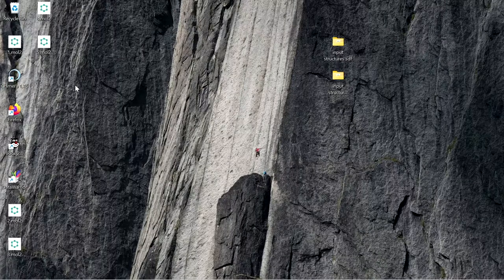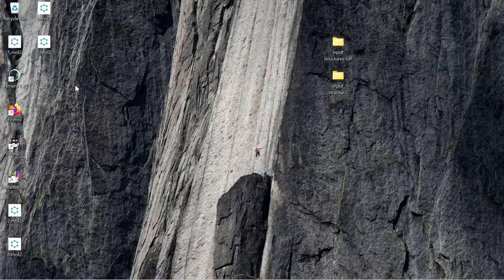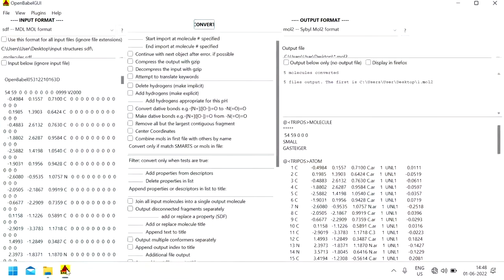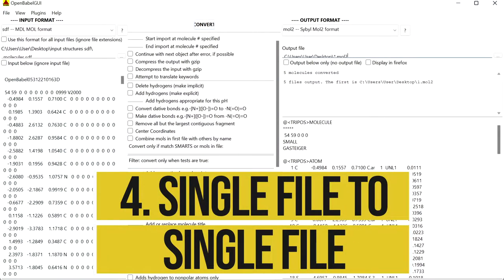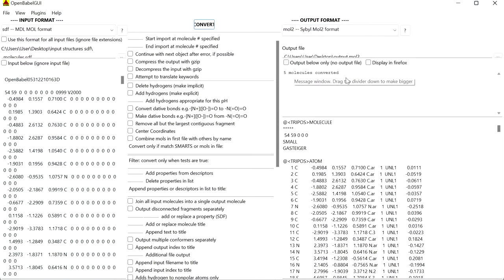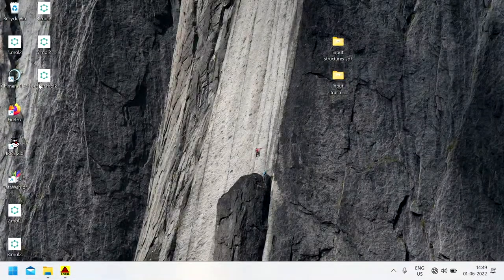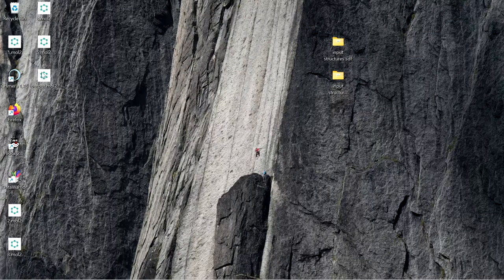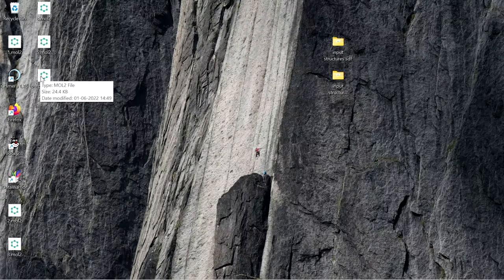You can also convert that single sdf file into a single output file with a different file format, for example mol2, pdb, pdbqt, etc. If you want to convert into a single mol2 file, enter the name of the output file as output.mol2. Now you can see five molecules are converted which are in the same file. In this output.mol2 file you have all five structures.